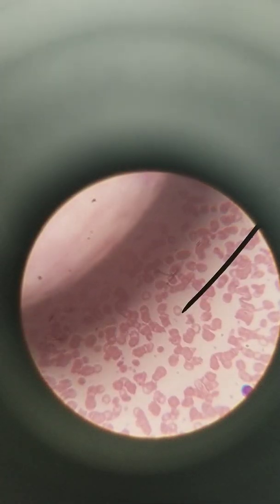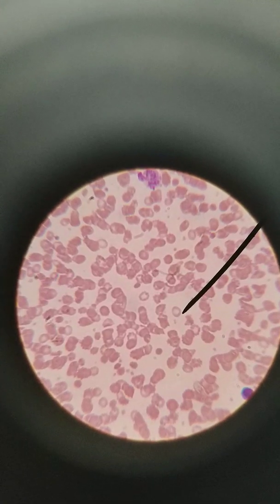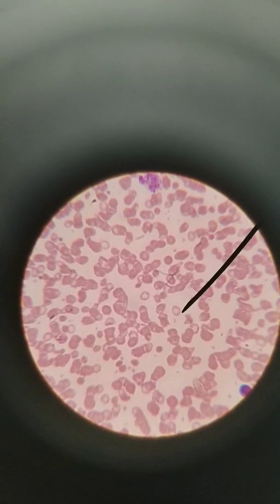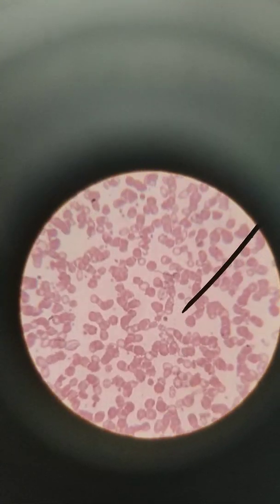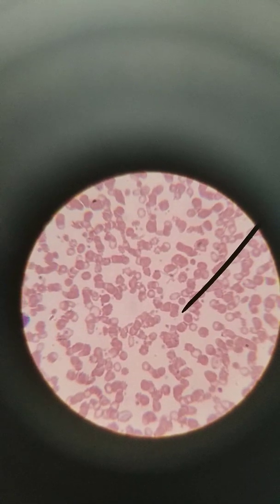Oh, that oil's traveling. Hold on. There we go. It is roundish, but look closely. The cell is a little bit smaller, and the white space is a little bit bigger than normal. These cells are a little bit smaller, and the white space in the middle is bigger than normal.